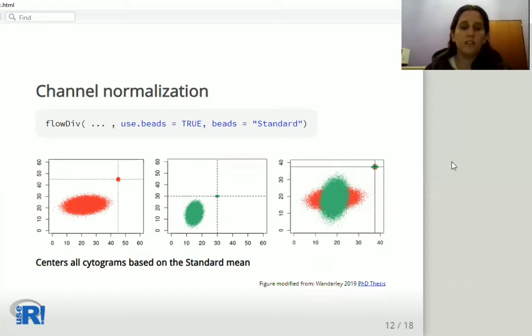FlowDiv's position in the cytograms depends on the instrumental settings. So FlowDiv centers all cytograms based on their standard mean.